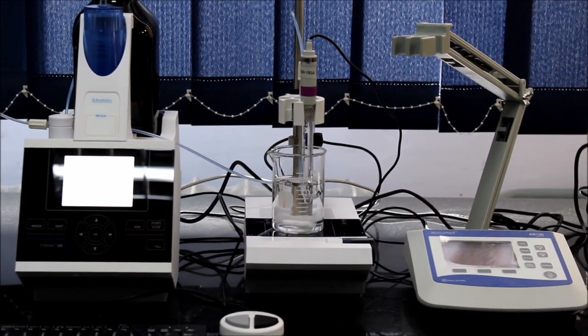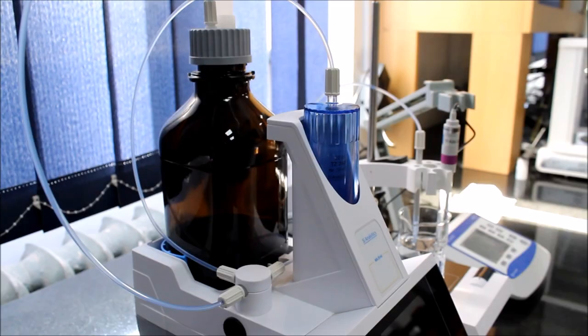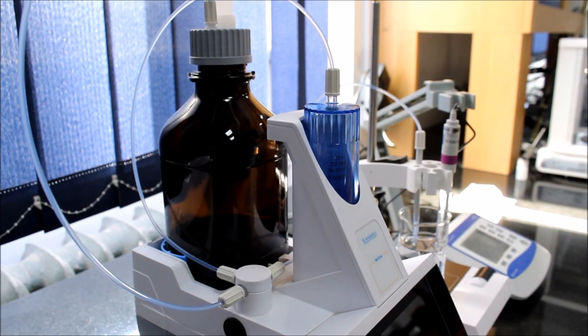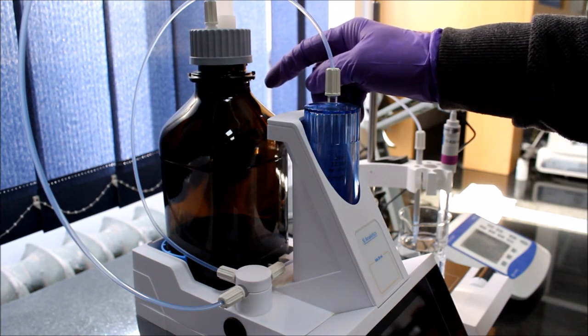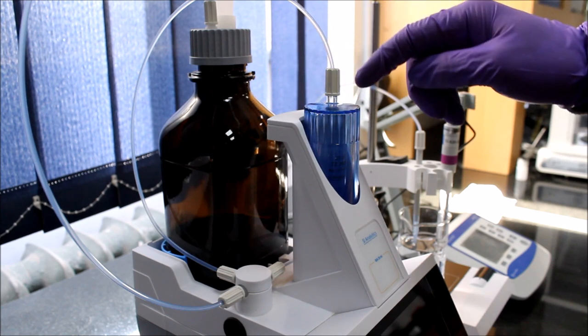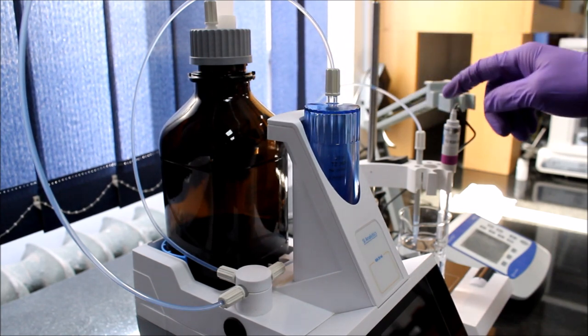So let's start with the autotitrator itself. Generally all autotitrator machines contain the bottle in which the titrant solution is stored. The water is pumped from the bottle to a little tube by the piston from which it is then delivered to the sample solution.